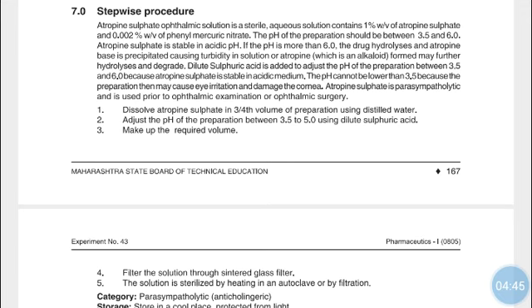After dissolving, adjust the pH of the preparation between 3.5 to 5 using dilute sulfuric acid. Check the initial pH, then add dilute sulfuric acid drop by drop until the pH is within the target range of 3.5 to 5.